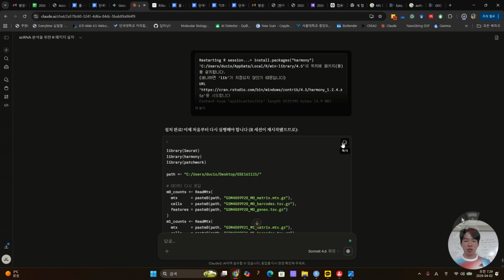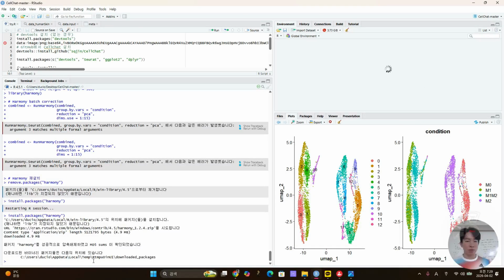So again, data loading. Maybe I have to make another session, probably, a new session.